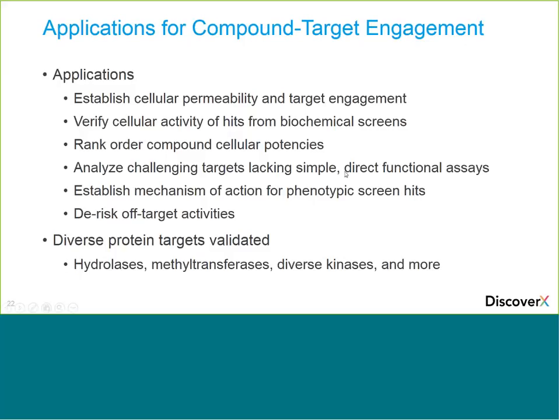Target engagement assay is very important here, as it is when you're trying to establish the mechanism of action for a compound that was a hit in a phenotypic screen. So you have a hypothesis that you're hitting kinase Y. You better be able to prove that the phenotype you're seeing is due to hitting kinase Y, and if you're getting cellular target engagement, that helps you build the case.